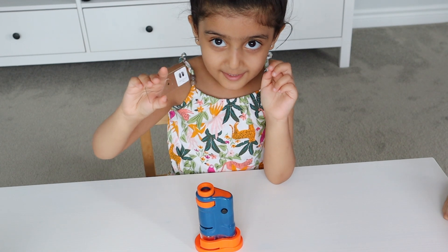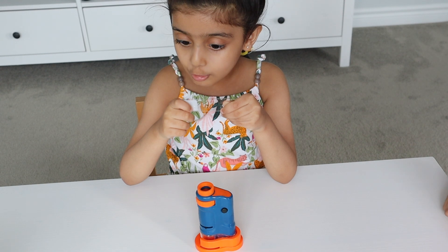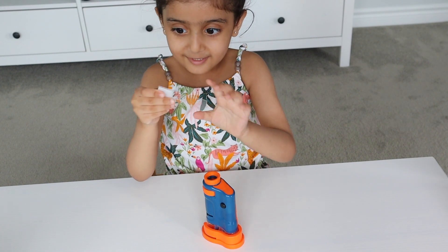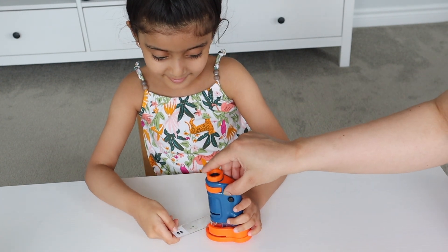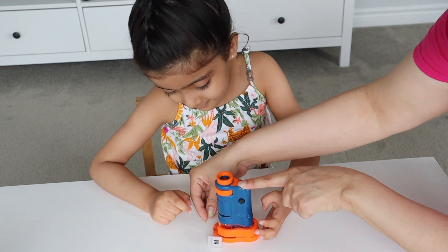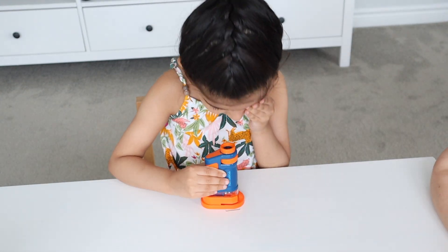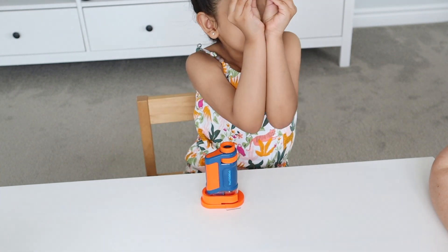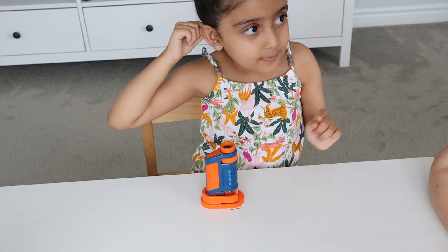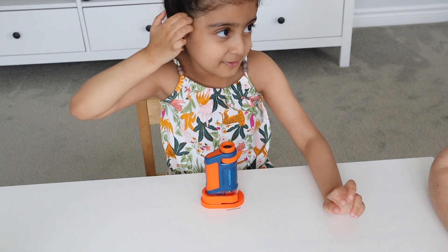I hope you can see this insect part — this is a dragonfly compound eye. We are going to insert this slide; be gentle. You have to insert it onto the circle. Now you can look through it. Can you tell us what do you see?